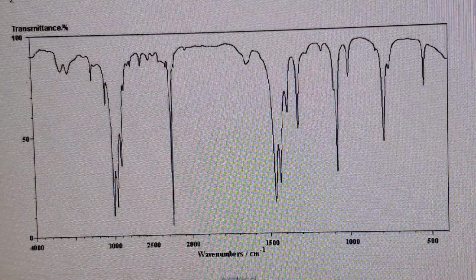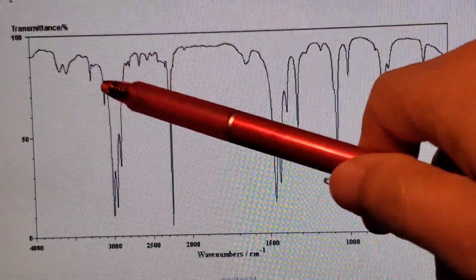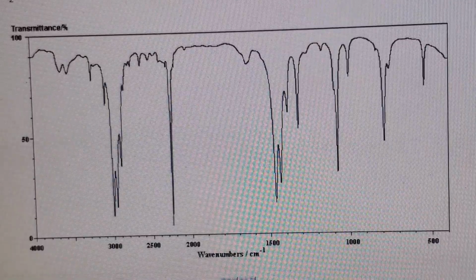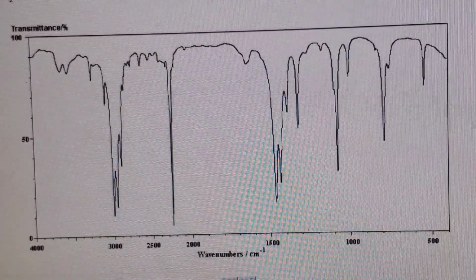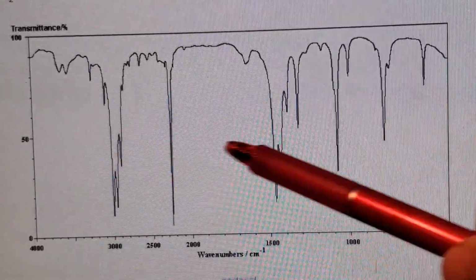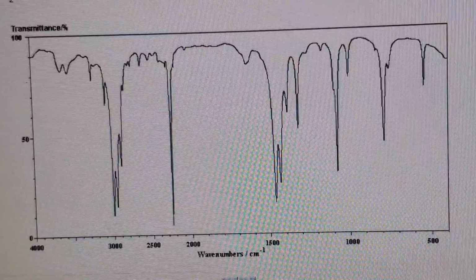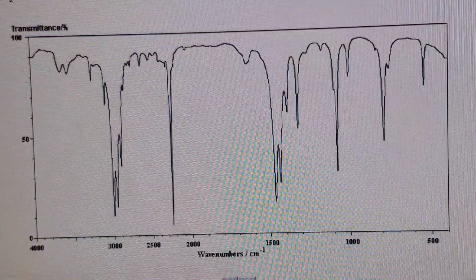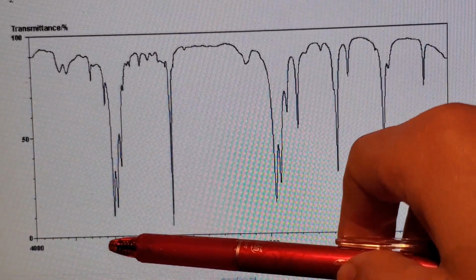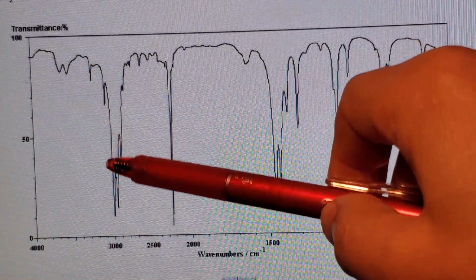So this one also can be good practice, because someone may match this with an NH2, but intensity wise you don't want to say it, especially when everything else is so tall relatively. That's too small. Just keep in mind though, there was such a thing. And then over 3000 you see a couple of signals, even a little shoulder here.